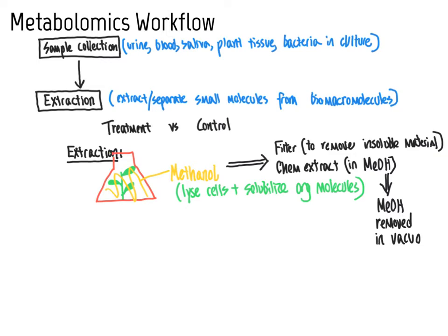On the other hand, as an alternative, if one were working with a sample that is liquid, such as urine or perhaps saliva or bacteria growing in a liquid culture, commonly a technique used for the extraction of compounds for those metabolomics analyses is what's referred to as liquid-liquid extraction.